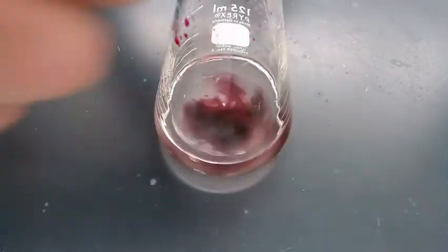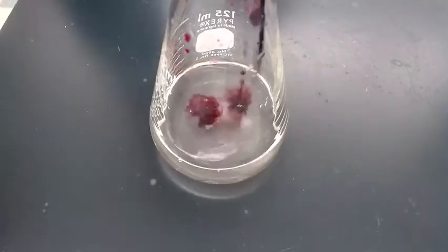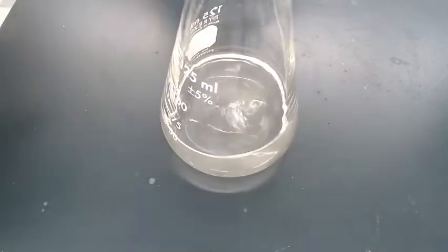So I'm going to put a bunch in. It's kind of staying a little longer, kind of like that phenolphthalein solution. So I'm going to put some more in. Stays a little bit longer, but then goes away. Let me see if I can get it off the sides.